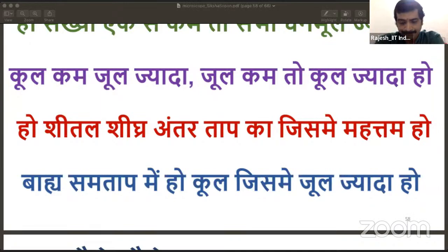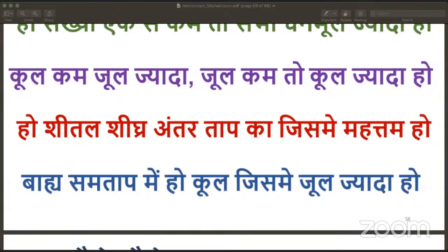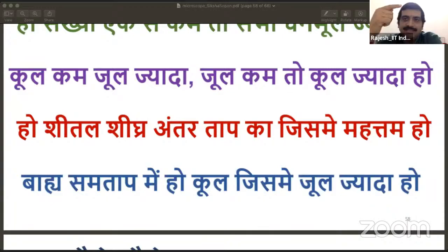Sir, may I ask one more question? There is a follow-up question, Jyoti, please. What happens with the electrons after they hit the surface? Okay. So suppose the electrons hit the surface, then a current flow is maintained inside the surface.